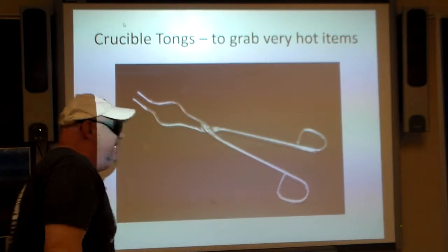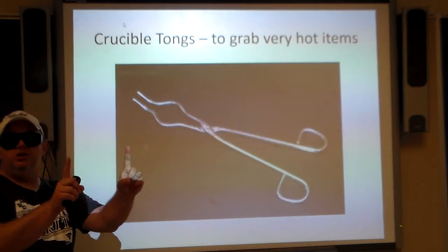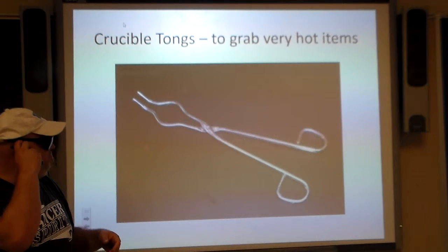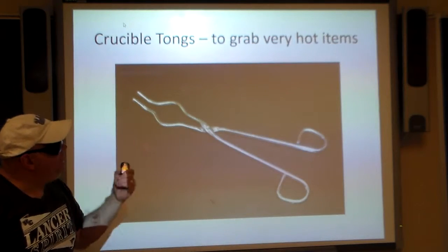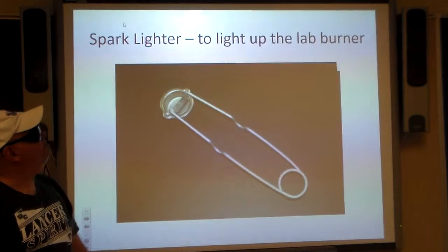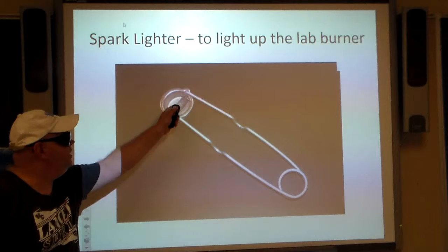Crucible tongs — yes, they can be tiny, which is what you'll use, but I also have a major large one which I call the nostril splitter — I'll let you figure that one out on your own. This is what you use to grab really hot items because you don't want to burn your fingers.